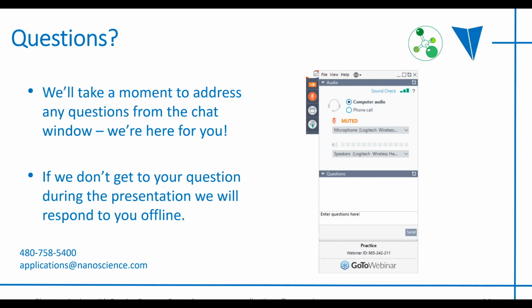The next question I have for you, does the needle capillary move during the spinning to enhance uniformity of the web? Yes, so when we're collecting onto rotating drum collectors or mandrels, we typically move the spinning head, the needle, in one axis, so back and forth along the length of the drum. We can also, in the LE100, move the spinning nozzle in 2 or 3 dimensions, so we can coat uniformly a stationary flat collector as well.